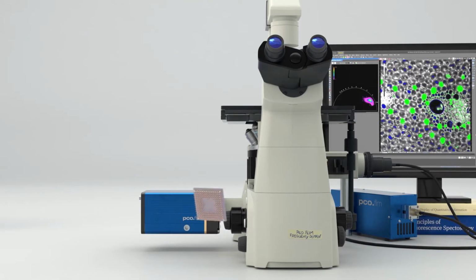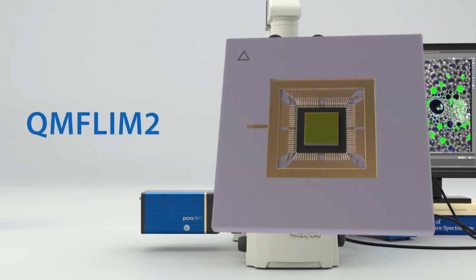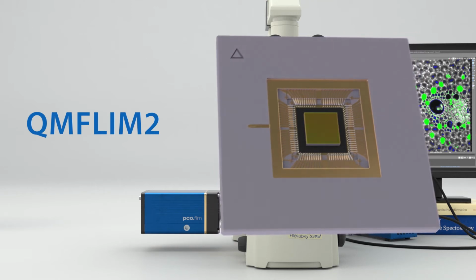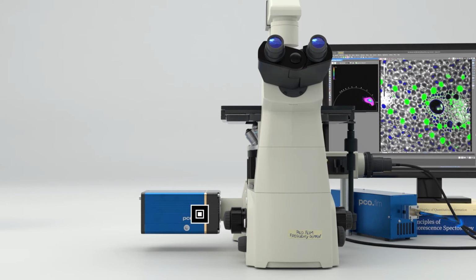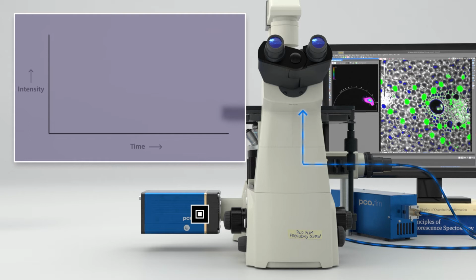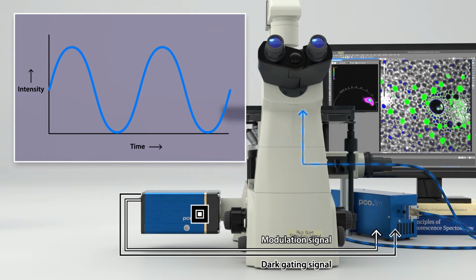By the development of a novel, fast, modulatable CMOS image sensor, the QM-FLIM2, the so-called frequency domain method became more attractive. In this frequency domain approach, the intensity of the excitation light is continuously modulated using sine or square waves. The modulation source is the camera, which provides modulation frequencies ranging from 5 kHz up to 40 MHz, as well as the signal for dark gating.